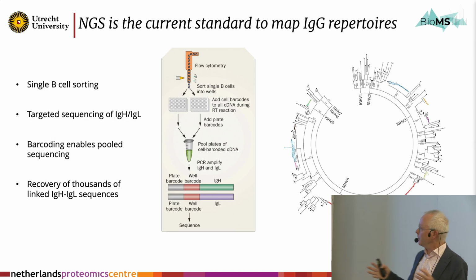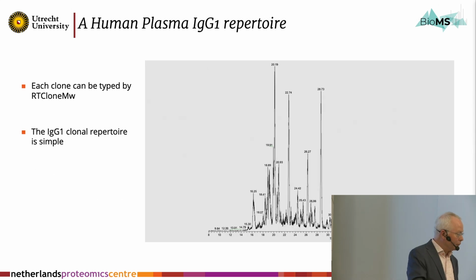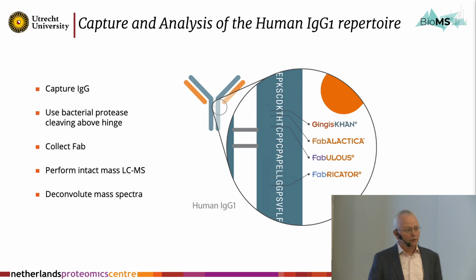Yeah, so this is the method of choice so far. It works, but it doesn't tell you which antibodies are really made and end up in circulation. Now, then comes our big breakthrough. Oh, but with hindsight it looks extremely simple.